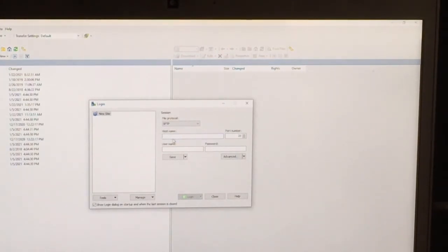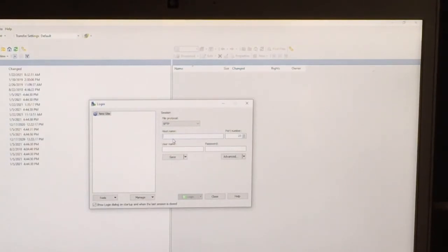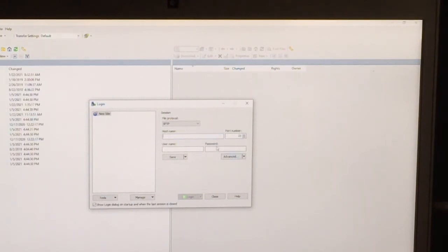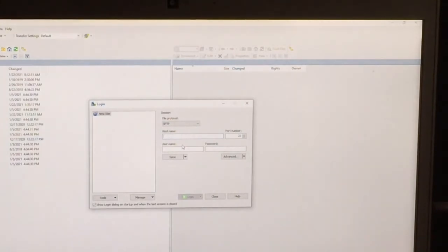Here in this window, you can see you will need to enter host name, which is the serial number of your console, and a port number. We just use the default number, which is 22, and username and password, which are both LICOR, lowercase, no space, no symbols.